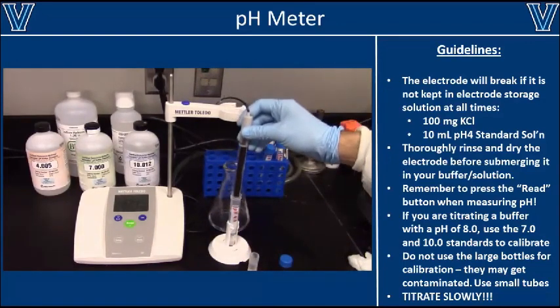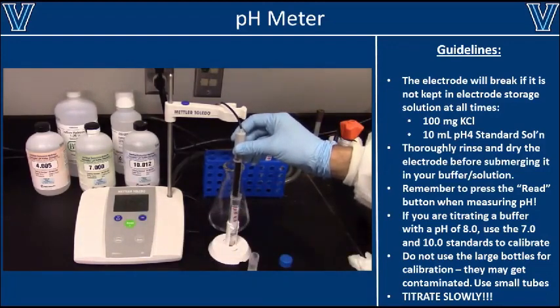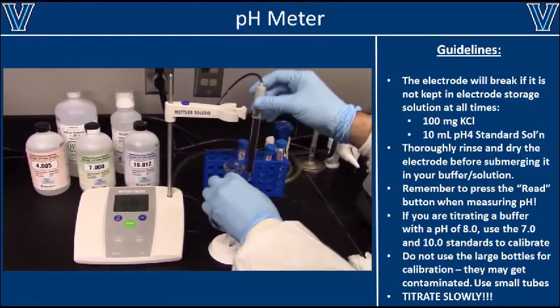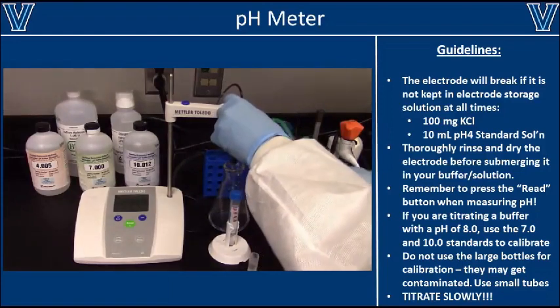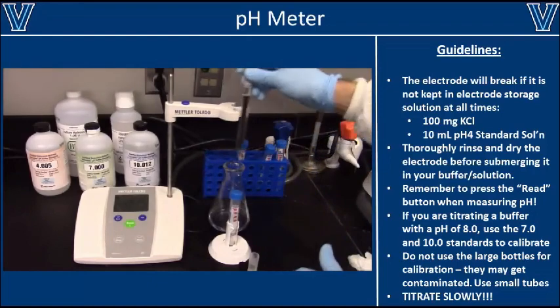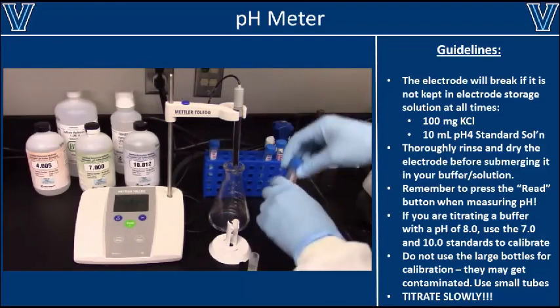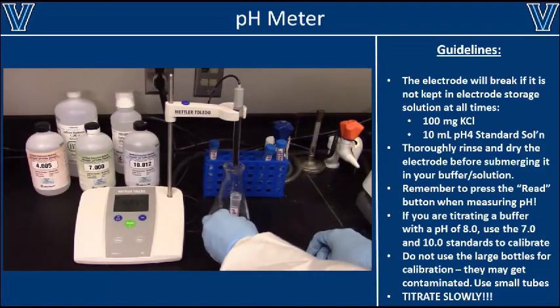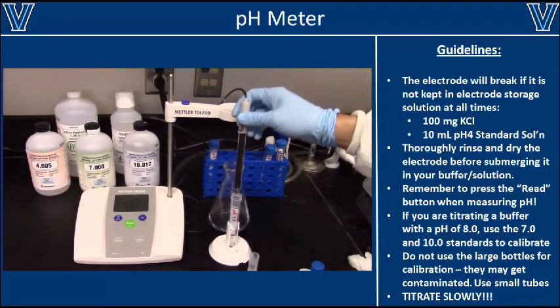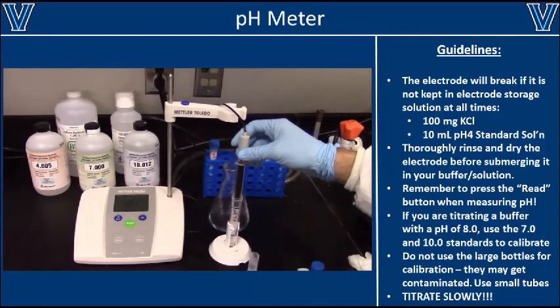You can refer to the manufacturer's instructions for specific protocols on how to calibrate your pH meter. However, in general, pH standard solutions of 4, 7, and 10 are usually used to calibrate pH meters. When calibrating the meter, it is important that you use the two standard solutions that are closest to the pH of your buffer. For example, if you plan on making a sample with a pH of 6, you want to calibrate with the 4 and 7 standards. However, if the pH of your buffer will be 8.5, then you want to calibrate the meter with the pH 7 and 10 standard solutions.